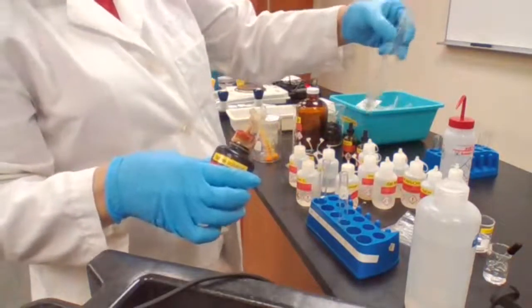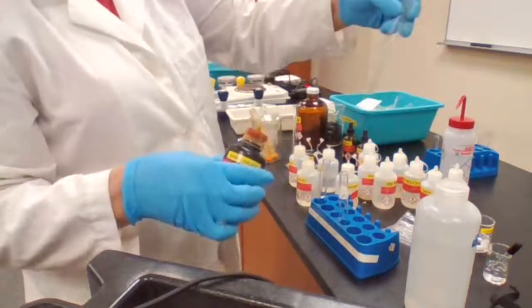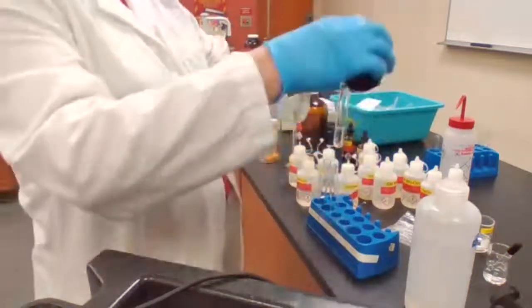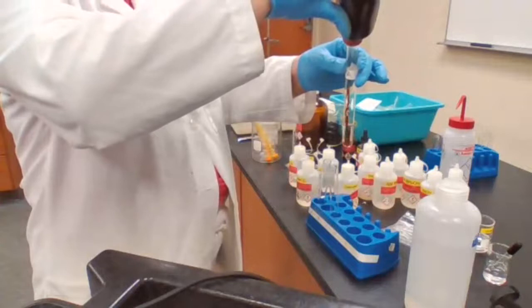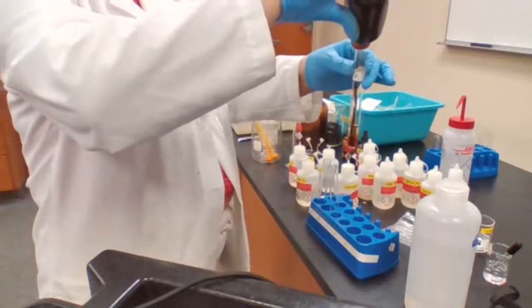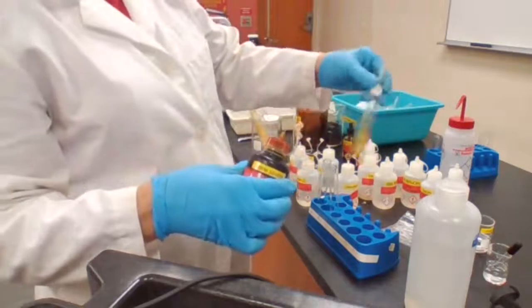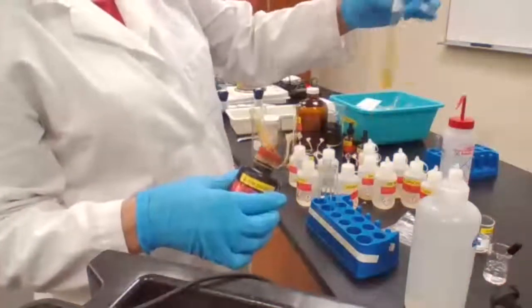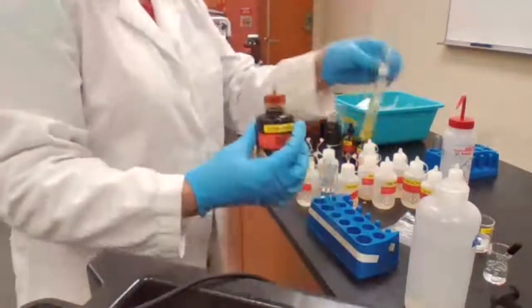If a yellow color precipitate appears, that means that is the methyl ketone. If not, we have to repeat this. It says to repeat this up to like 60 drops. But as soon as I see the yellow color precipitate, I'm not going to continue, because the key is not how much of the reagent I add, it is to see the yellow color precipitate.